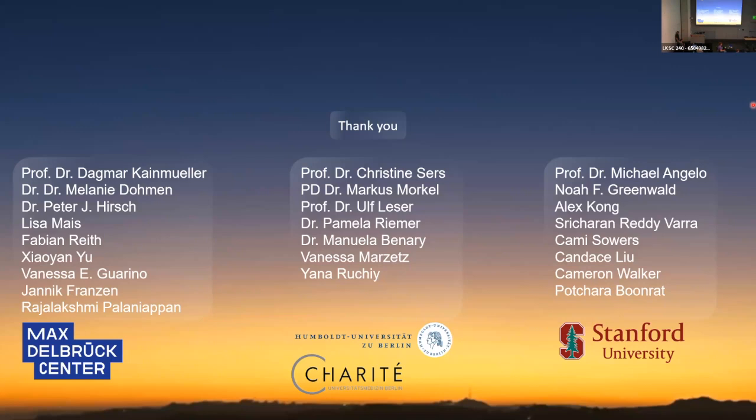Thanks for a very clear presentation. Looks like a great approach. I'm curious, there are biological contexts where molecules get polarized to one face of a membrane for a reason, like say cell migration or an immunological synapse. Does that information get lost using this method, or have you thought about ways to try to retain that?